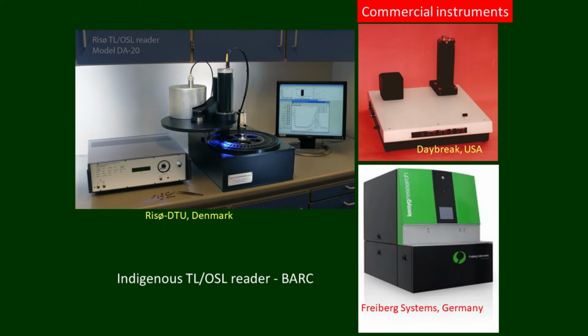This slide shows the available instruments in the commercial market. On the left hand side there's a RISO reader from Denmark that's widely used, and also in the USA, the Daybreak company makes them. Below that is the Freiberg system from Germany. So these are the available readers. What we have in our laboratory is RISO made. There are also attempts to make an indigenous TL OSL reader by BARC. That's also going on. Very soon they will be successful.